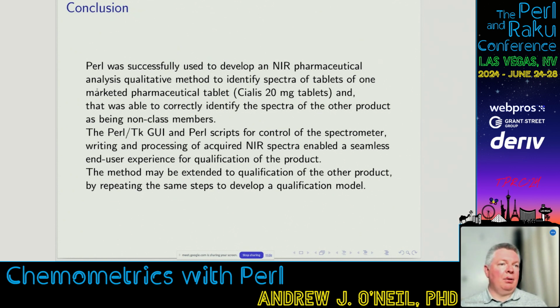I have a study that I'm ongoing with Oxford University in the UK, where I have done some work looking at quantifying the levels of antimicrobials and antibiotics in tablets, and developing NIR methods to quantify the level of antibiotics, irrespective of the actual matrix composition. Which is quite a new development. And so I use it for that as well.